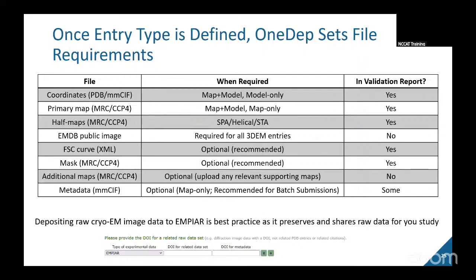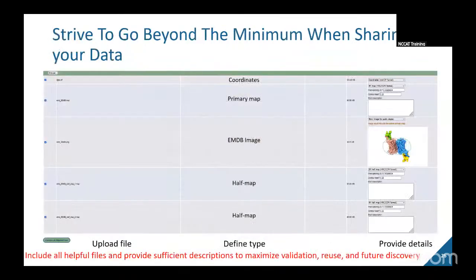The other thing is the additional maps. So the additional maps, when you go to EMDB, it'll just say additional map 1, additional map 2, which is not terribly helpful. Yeah, it's not. It would be useful if there was a way to. So there is actually, and I'll go ahead and switch to the next slide, and I'll work that in.